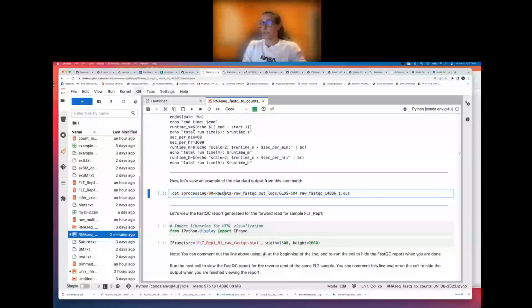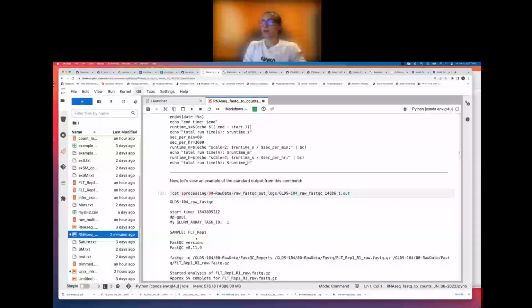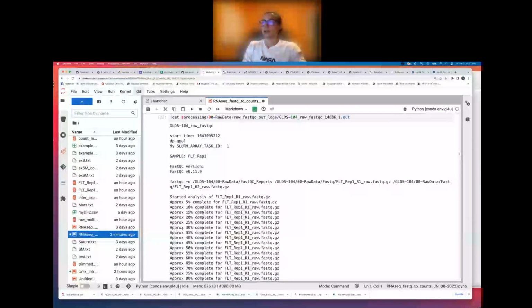So we can go ahead and run that. And you should see something that looks like this. Is there anyone that's not seeing that? Okay, so I assume you guys are all looking at the same thing I am on my screen.